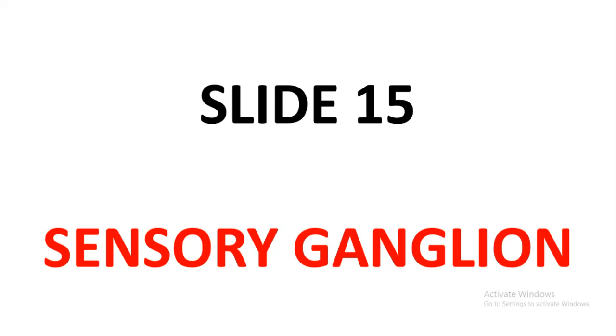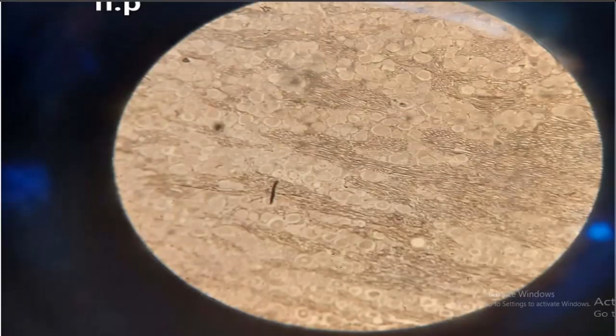Now, what are you supposed to draw in this slide? What you need to draw is 3 to 4 nerve cells with their satellite cells. You need to understand that these nerve cells are surrounded by the satellite cells, and these satellite cells are just trying to support the nerve cells. So let's quickly look at this sensory ganglion.